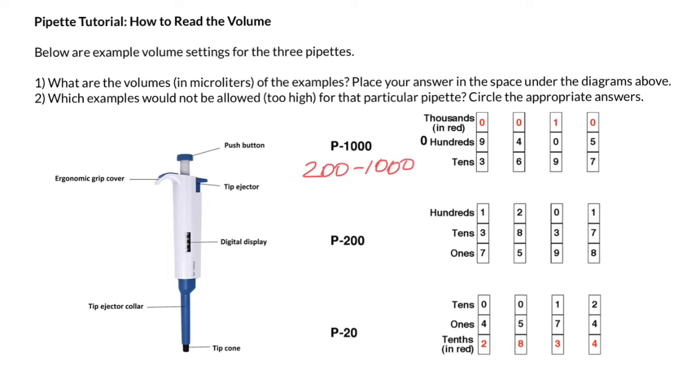And P200 measures between 20 and 200 microliters. And P20 between two and 20 microliters.